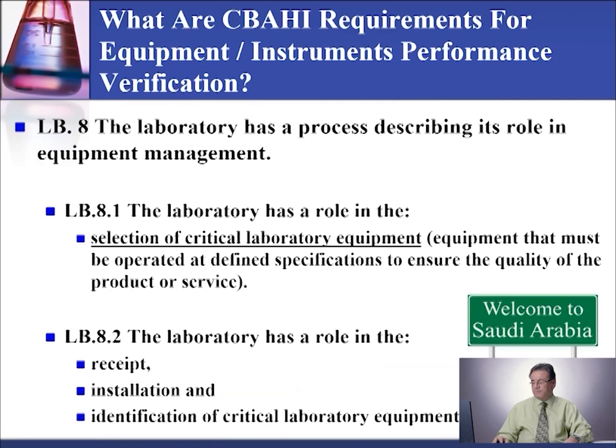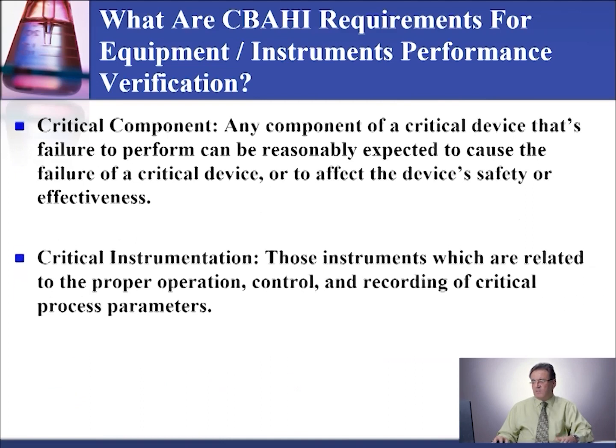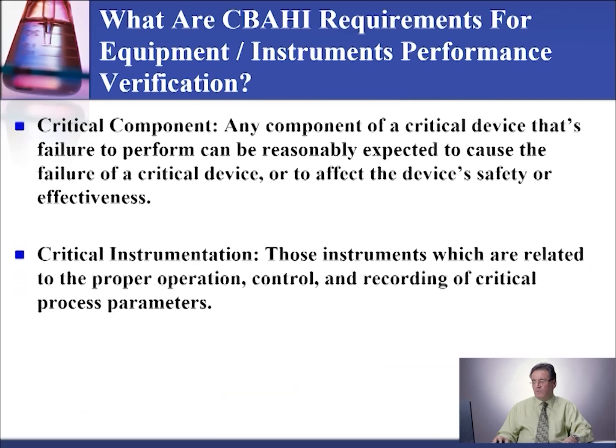Operational qualification is the documented verification that equipment or instrument, with all the major components tested, functions according to its operational design and specification. In other words, fit for the selected purpose, use, area and environment.